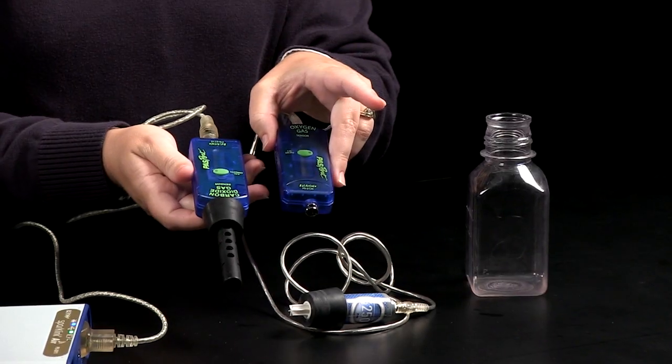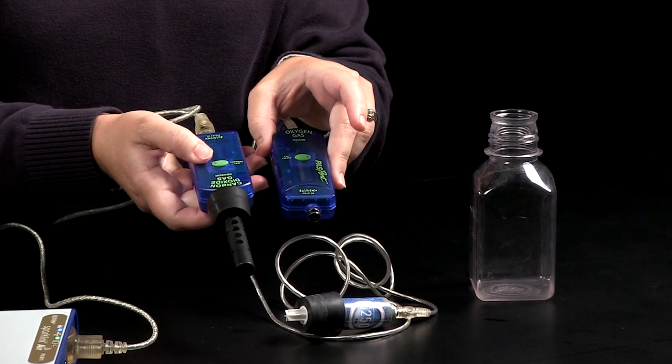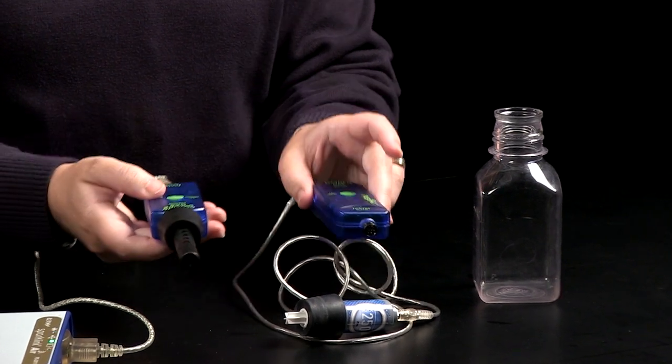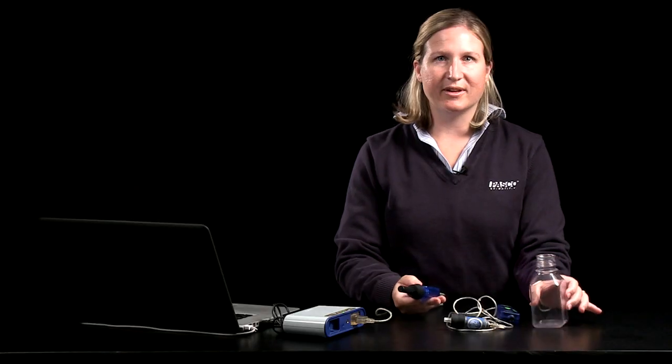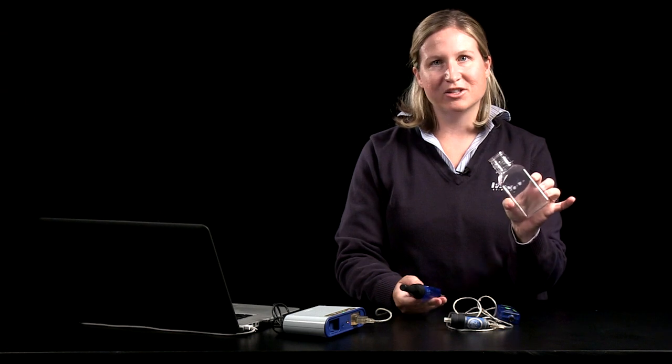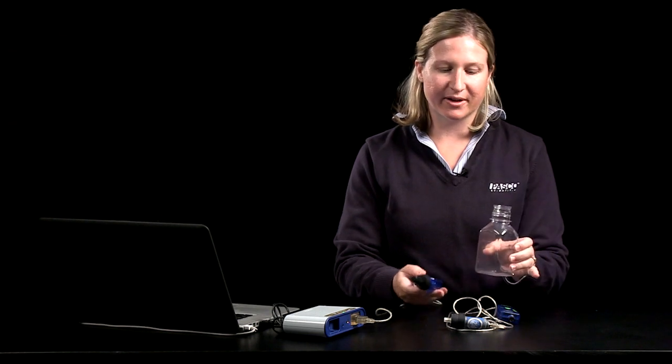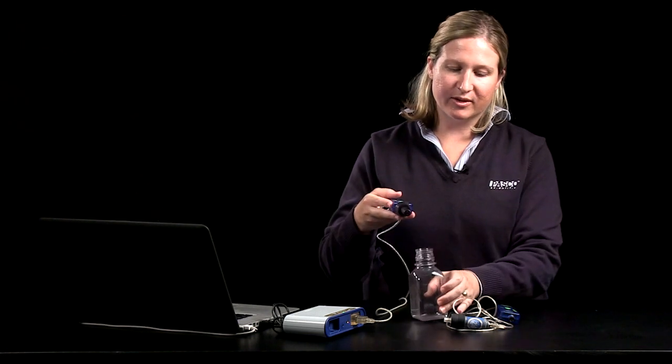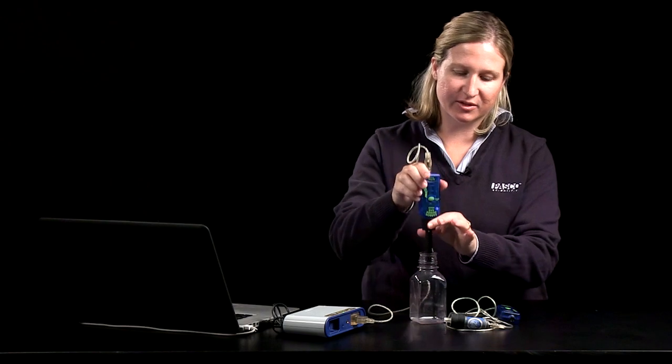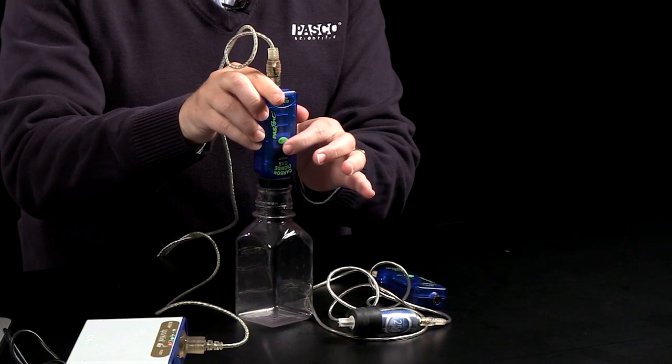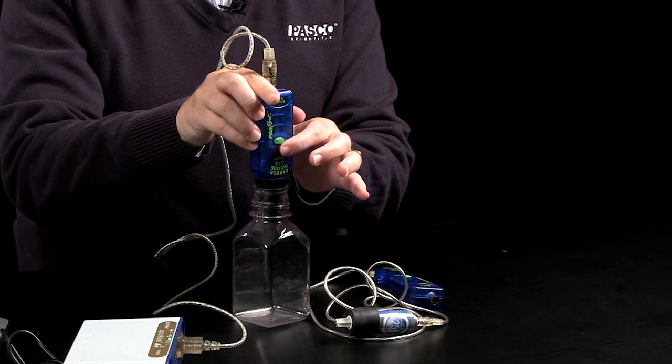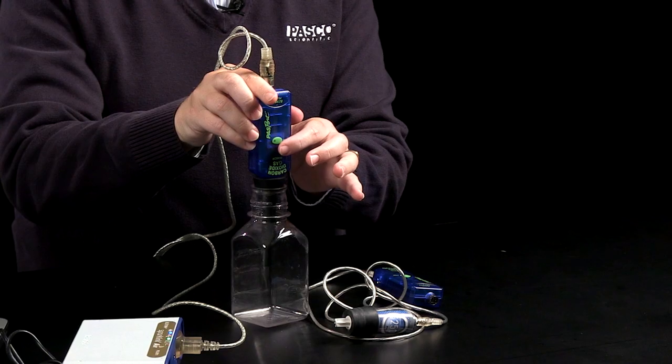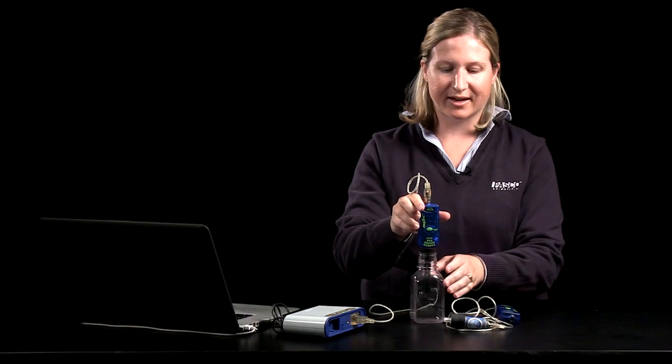The front of each of the sensors has a green calibration button and you'll want to calibrate using an empty sampling bottle. Each of the sensors comes with the sampling bottle. You can plug the sampling bottle with the sensor, hold down the green calibration button, and when you see the flashing light behavior change, then you know that your sensor is calibrated.